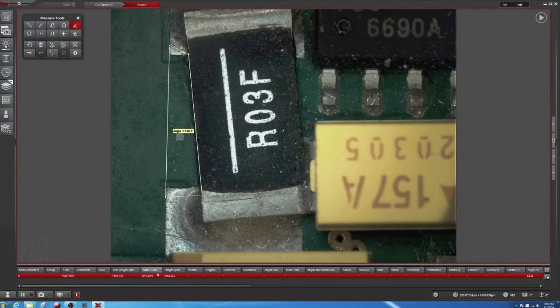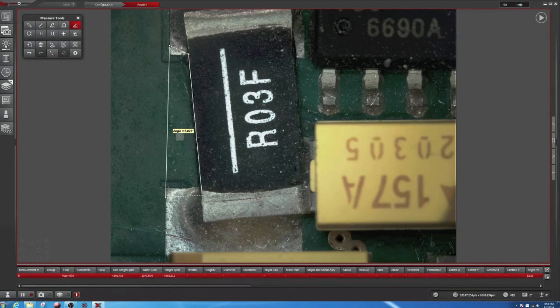Here we have the measurement, and we can also define what's written in this measurement with the measurement options.